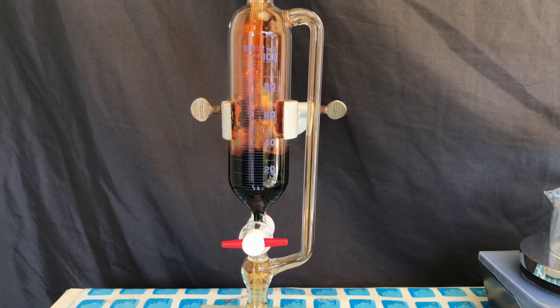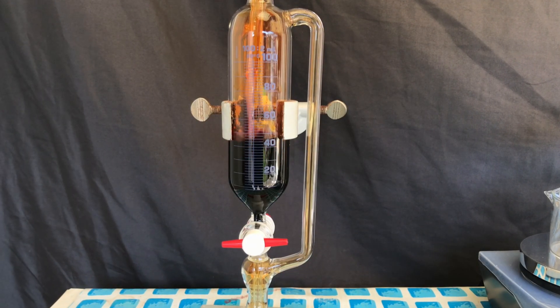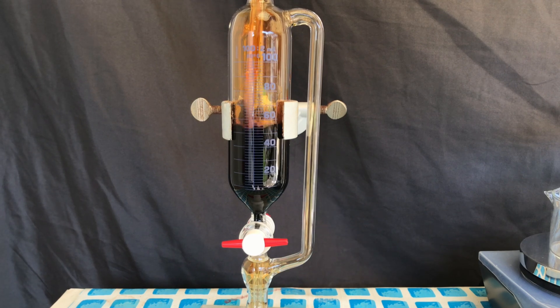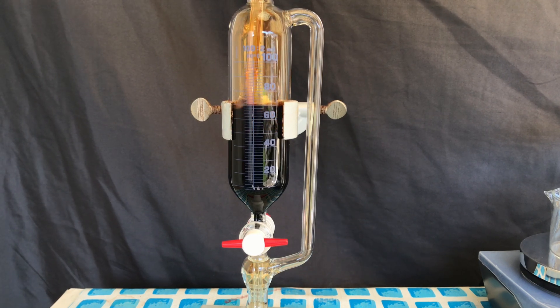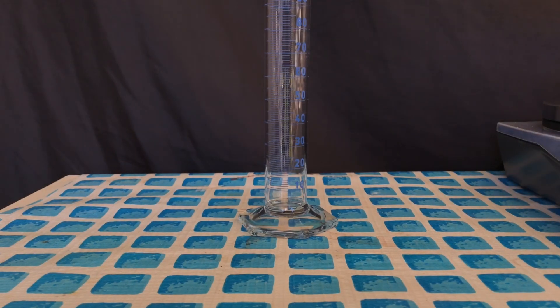To make this reaction more efficient and also a little tamer, DCM was added to the bromine. Dichloromethane is a good inert solvent for brominations and you could also use trichloromethane or even tetrachloromethane.